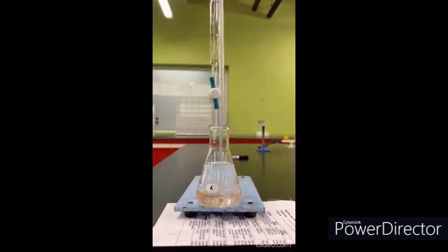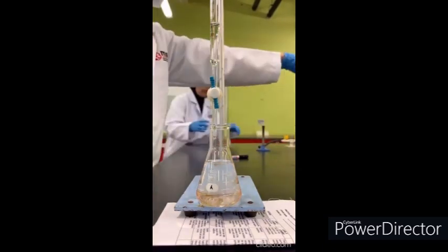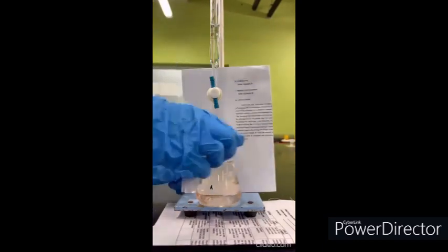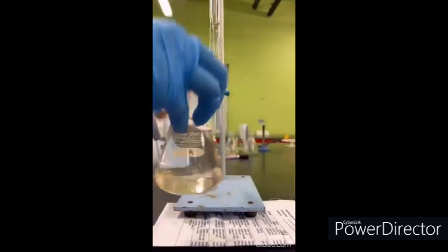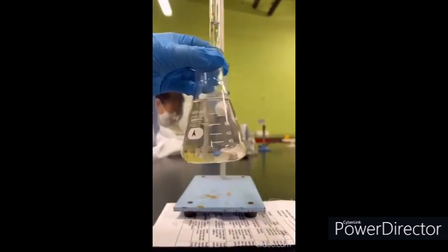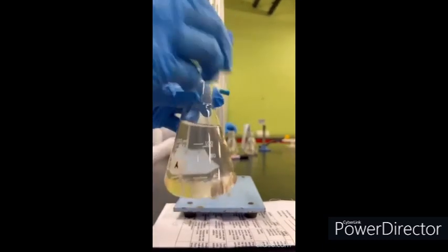At this stage, the solution is getting less acidic and neutral as the onion indicator is changing to colorless. To ensure the color of the solution, it is checked with a white background. The endpoint is obtained when it changes to slight yellow or green for 30 seconds. Record the final reading of the burette and repeat with the second sample.